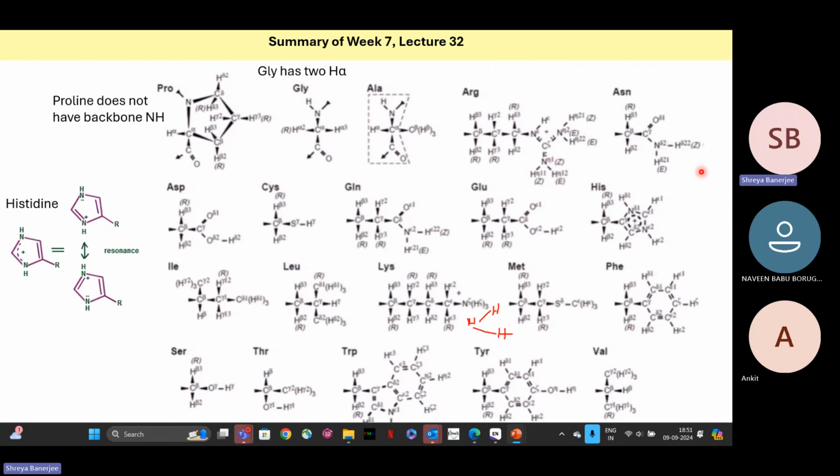It can be asparagine, where you can see up to delta hydrogen. It cannot be aspartic acid, because there the delta hydrogen is exchangeable. It will exchange, so you will not see the delta hydrogen. Or it can even be leucine. In fact, leucine is the most probable, because in asparagine you have a gamma carbon, but a gamma hydrogen is not there.